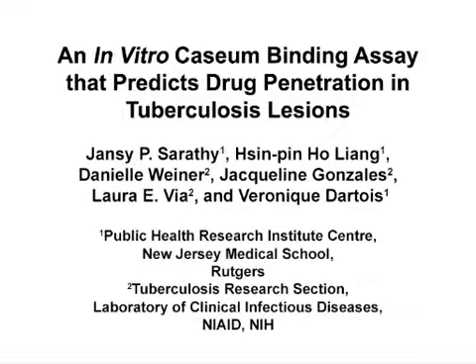The overall goal of this protocol is to predict drug binding to caseum from tuberculous lesions. This method can help determine how effectively antimicrobials penetrate the caseous core of necrotic lesions without the use of animal models and expensive imaging techniques.